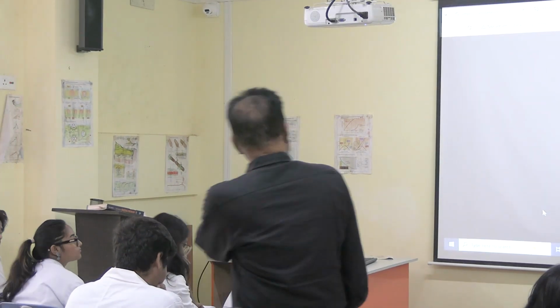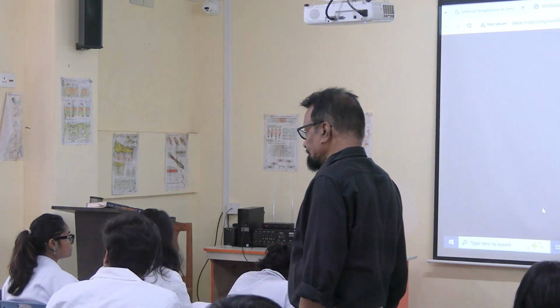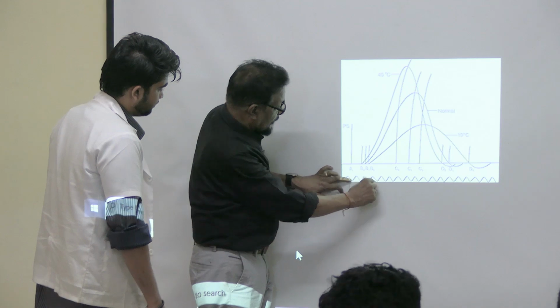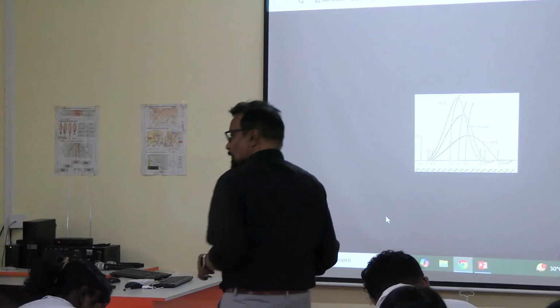Now let us see what happens to these periods with 40 degrees centigrade Ringer solution. Who will calculate? We will count the number of divisions. Let us count from the bottom. So from here to here, this is 1.25. 1.25 into 0.01. So this is the latent period for 40 degrees centigrade.